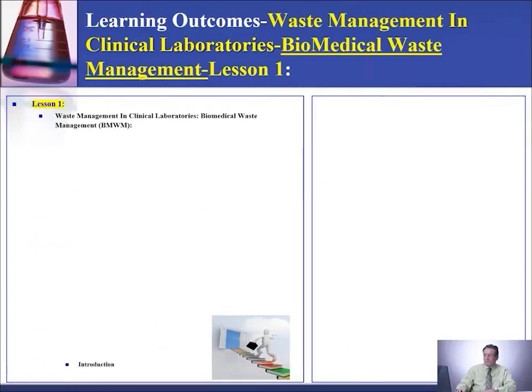We're going to be starting to talk about biomedical waste management in clinical laboratories. In Lesson 1, we'll talk about an introduction to the topic. Then we'll cover biomedical waste classification, then the magnitude of the BMW. Who generates BMW, biomedical waste?